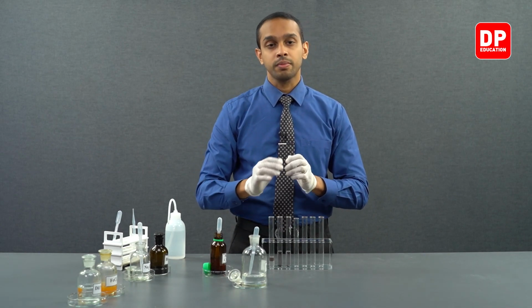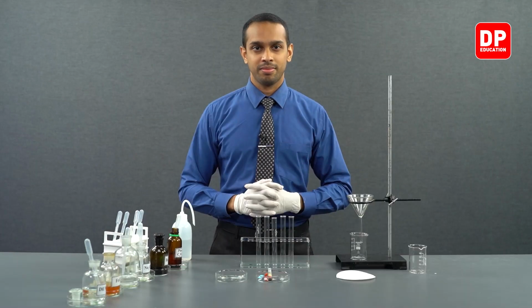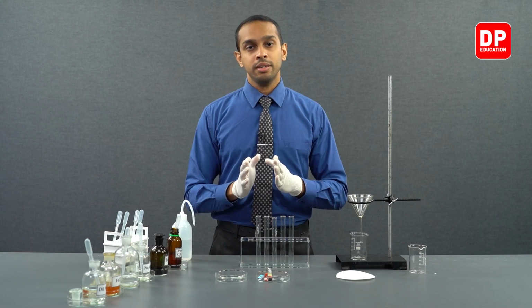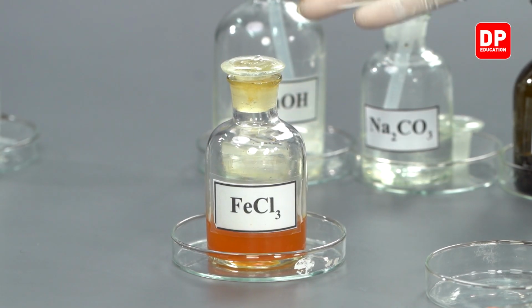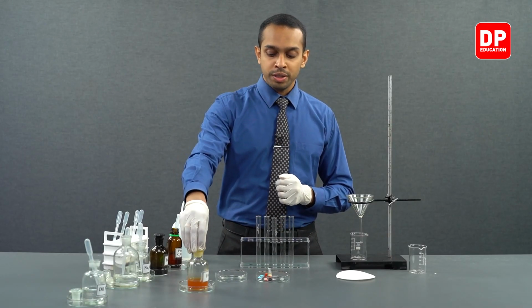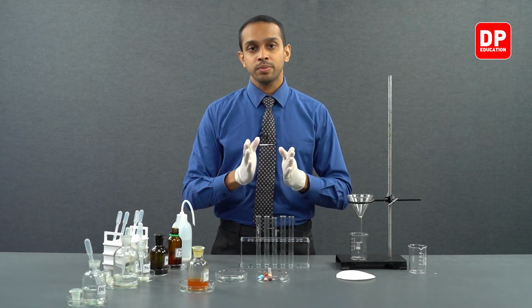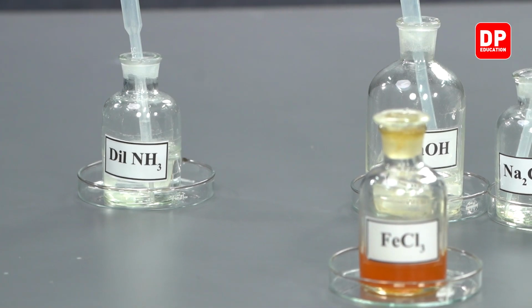Now, let us move on to the next part of our experiment. In this part of our practical, we are going to observe how ferric chloride reacts with phenol. This is an acidic salt. Therefore, we need to react the ferric chloride solution with dilute ammonia and produce a neutral ferric chloride solution.